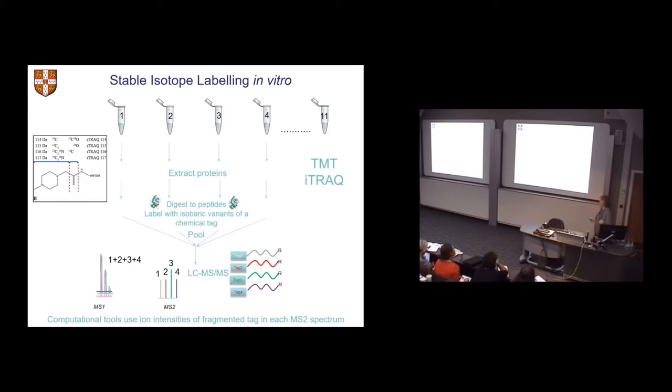You merge everything together, carry out mass spectrometry, and we're using different rounds of mass spectrometry, and if a peptide's present in all your fractions, then you will see a mass which corresponds to that peptide, but then you carry out tandem mass spectrometry, and you fragment your peptide. You get useful ions, which will tell you what the sequence of the peptide is, and therefore what protein it's been derived from. But the tags drop off to give you the abundance of that peptide, and therefore the protein it came from, in your samples.